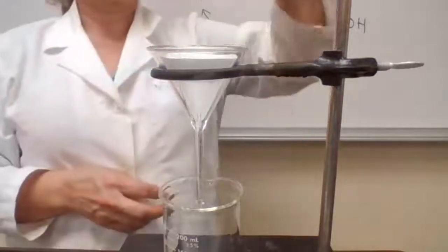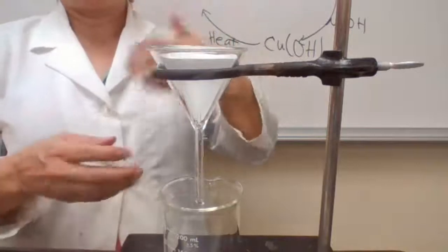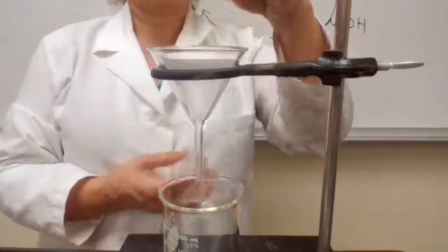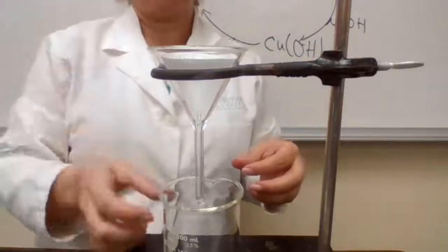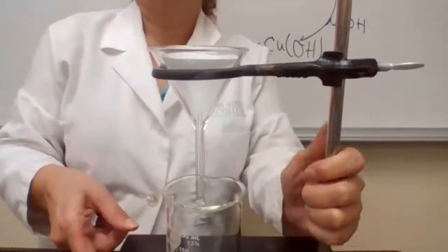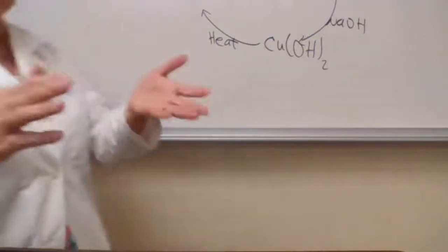Then you are going to pour the mixture of the liquid and solid that you have in a step of the experiment into the filter paper. The solid would stay on the filter paper, and the liquid would pass through the filter paper, and you will collect your filtrate in a receiving container. Yes, exactly, like a coffee filter. The setup here kind of makes sense, and I'm glad, just like coffee filters.